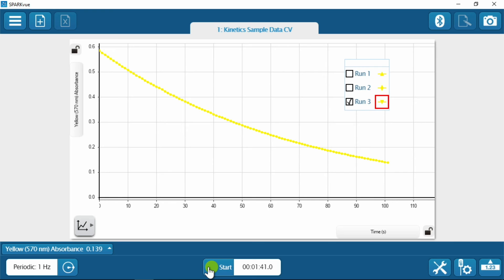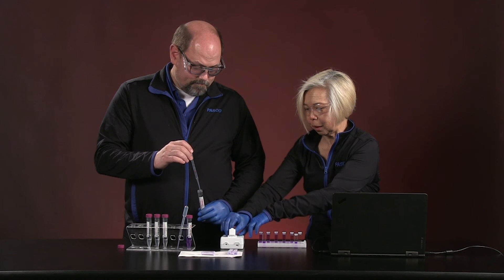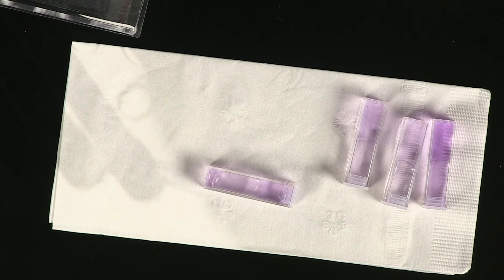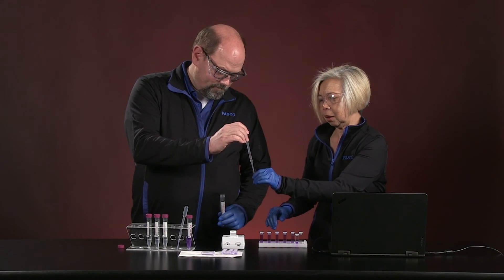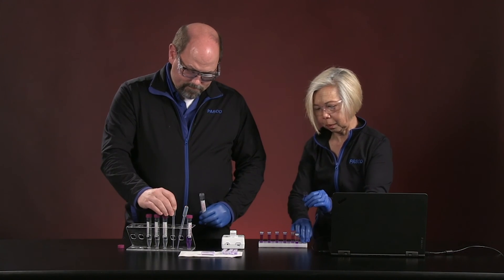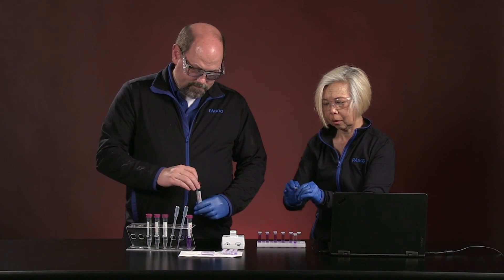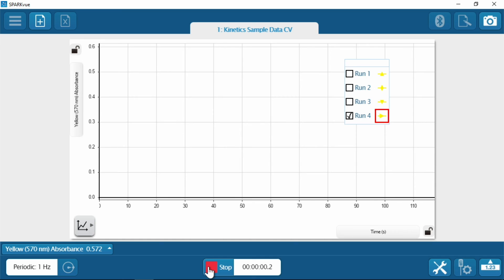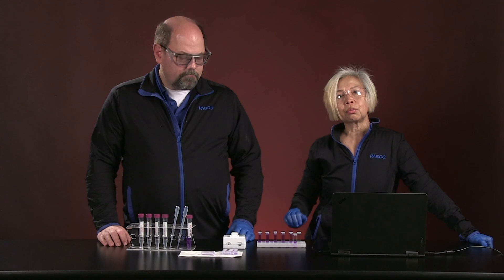All right, we're going to stop right there. Let's take this puppy out, lay it down. Whoa, look how much lighter it is now. Okay, so here's the old drain cleaner or the inexpensive drain cleaner.